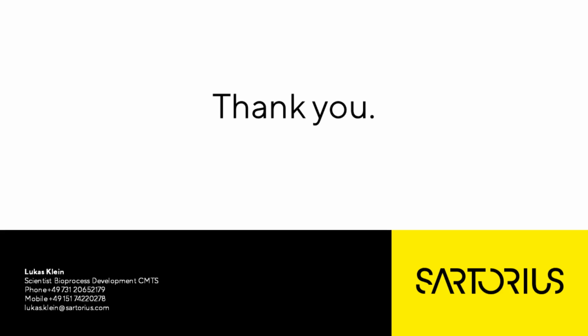So, by PC, I assume this means process characterization. I think in our hand, I would say it depends. In most cases, we use the Ambr 15 more for screening type applications. If you want to get a good idea and a first hint as to what the boundaries could be that you're looking at for your process parameters. If you want to go to larger scales, in particular, we recommend for a finer tuning to use the Ambr 250 type systems, which has some advanced control features that make it even easier to translate it to larger scale cultivations.